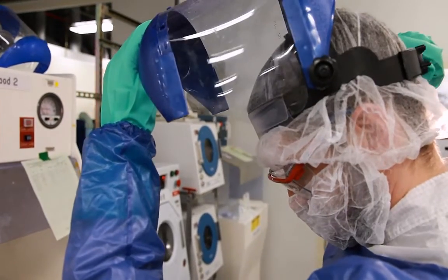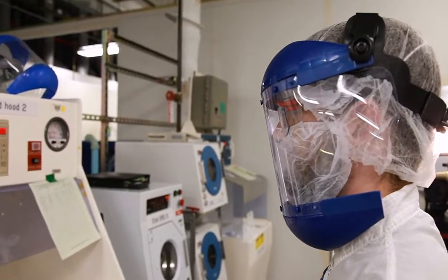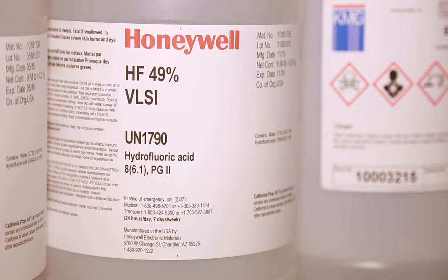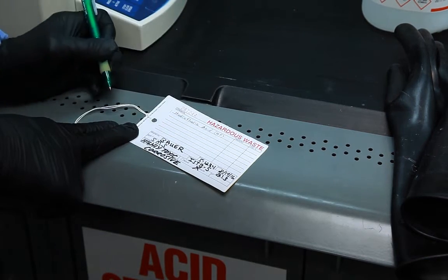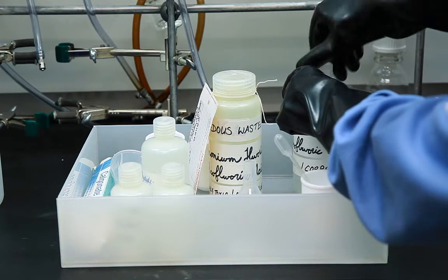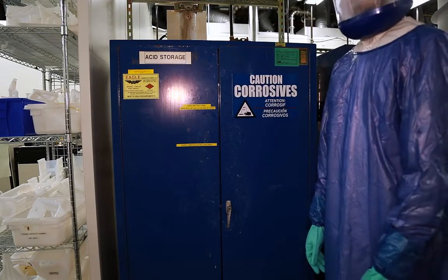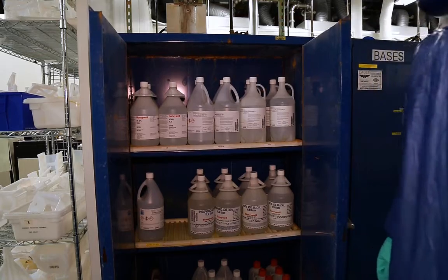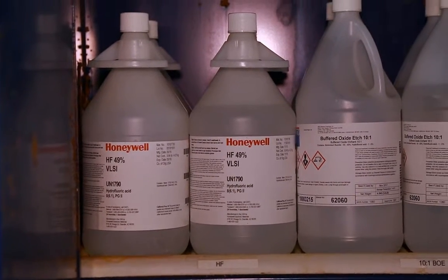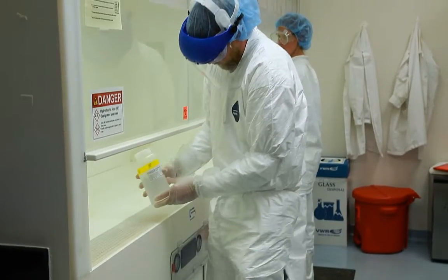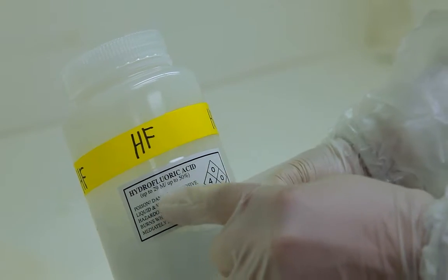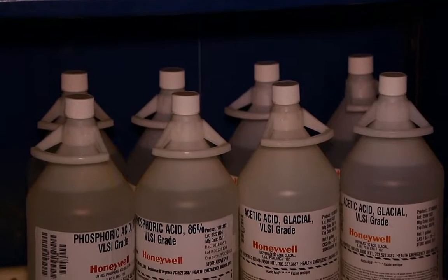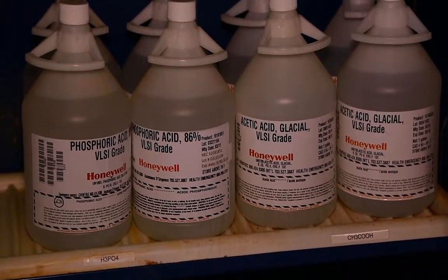Make sure it is in good condition prior to use and adjust the size to ensure a secure fit. Standard manufacturer labeling includes the product name and primary hazards. When preparing the label for a secondary container, you must write the words hydrofluoric acid along the concentration and the words highly toxic and corrosive. HF must be stored in approved corrosive storage cabinets. Before accessing HF storage, make sure you have donned the required PPE. Read the labels for container contents and hazard warnings prior to removal. ASU researchers typically use a variety of HF concentrations between 1% and 49%. Store HF with the label visible upon opening the cabinet doors to avoid unnecessary handling or potentially removing the wrong container.